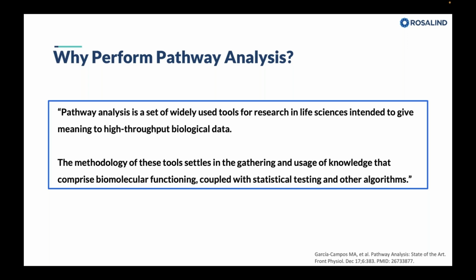targeted panel. And the second sentence down there is that we are gathering knowledge. We're gathering and using knowledge about the genes and their memberships in different pathways. So we're trying to assign functional roles to all of our different genes in our data set and inferring some additional second order pathway level information or even drug level information or cell types, that kind of thing. So it's really get as much as we can out of our data by learning about our individual genes and getting these higher level inferences.